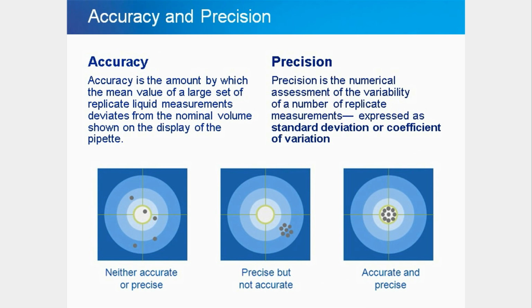Before we begin our review of specific pipetting techniques, I want to define pipette accuracy, as well as another important term, precision. Accuracy is the ability of a pipette to provide a dispense close to the volume, as indicated by the volume setting. Typical accuracy specifications for air displacement pipettes are approximately 1% for pipettes with nominal volume settings greater than 35%. For pipette volume settings at 10% or below, the specifications can be as much as 3 times less accurate.